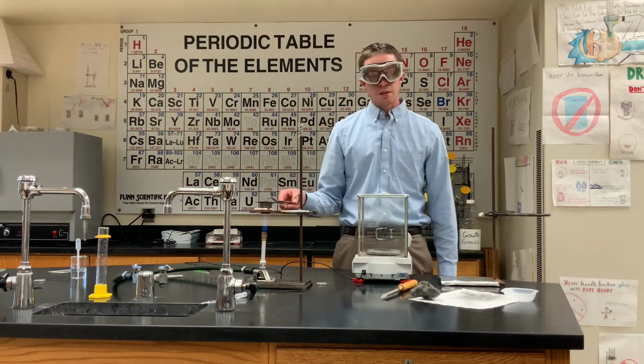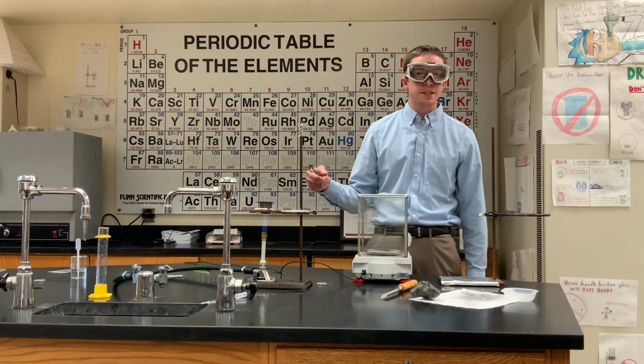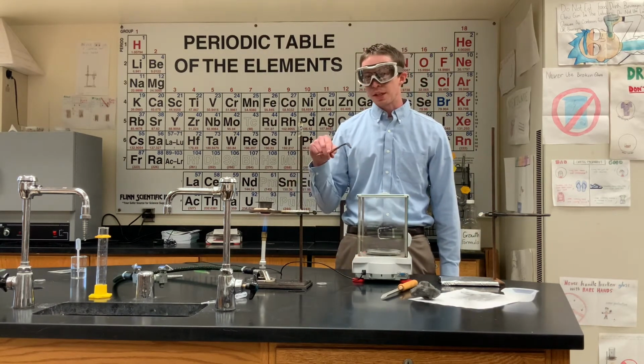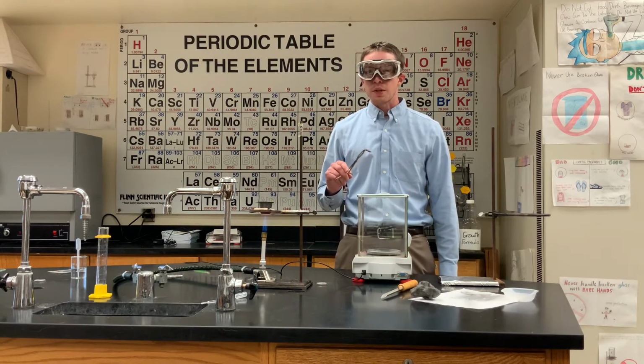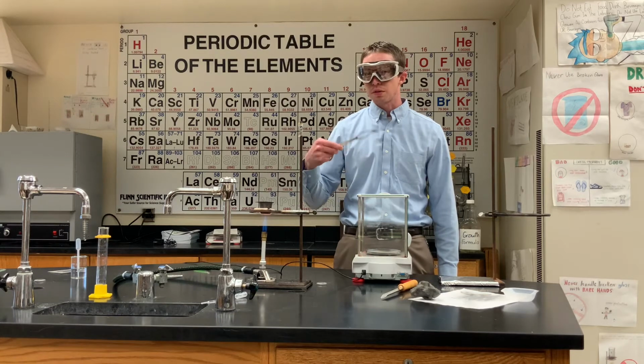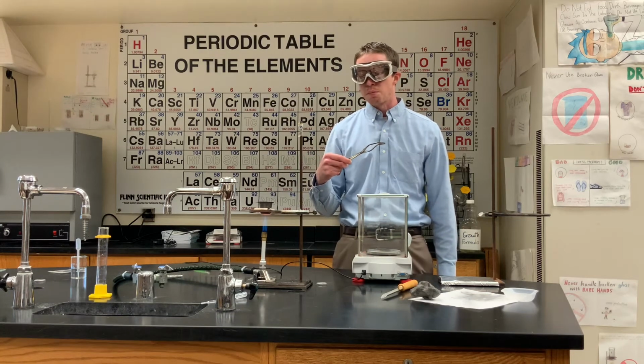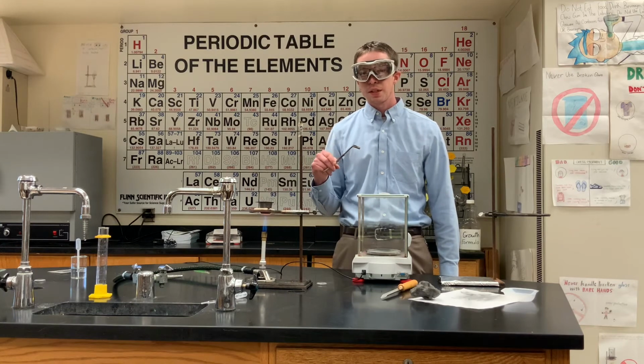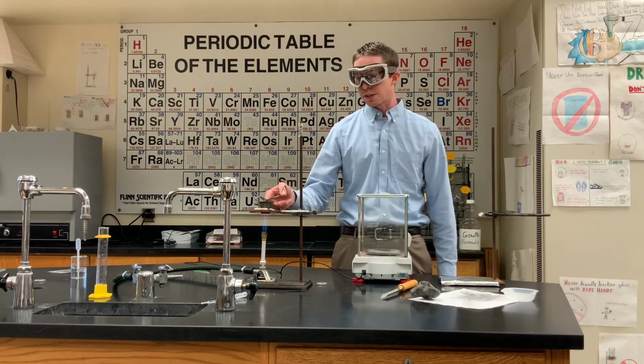So we're going to let this go. We're going to crack this about once every minute or so, and then we will be taking it off the heat to stir it before we put it back on. So at that point in time, we will show you the middle of the reaction and what it looks like inside the crucible, before we put it back on the heat.